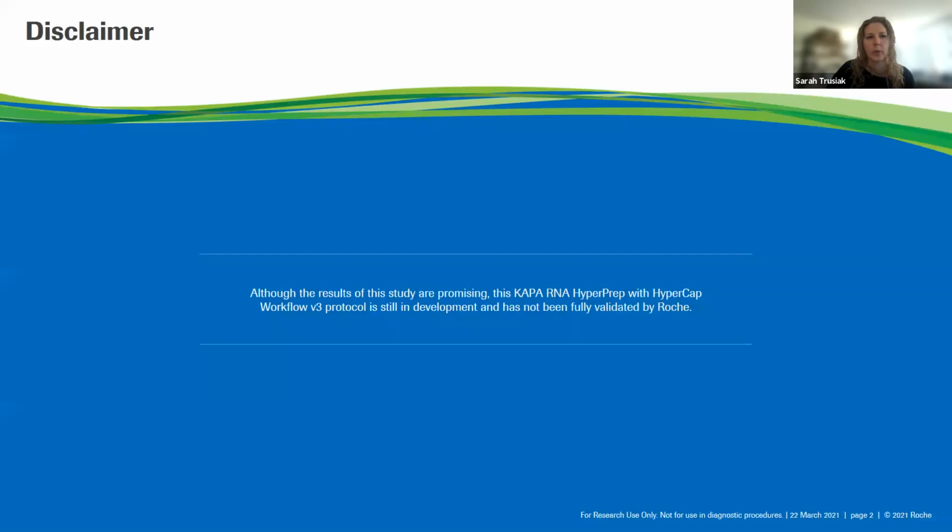So a disclaimer before I begin the presentation, although the results of this study are promising, the KAPA RNA HyperPrep with HyperCap workflow v3 protocol is still in development and has not been fully validated by Roche.